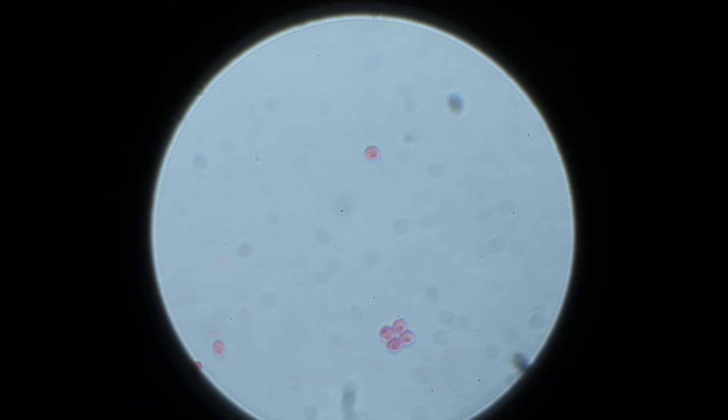And one, two, three, four spots, maybe five in the left one. There's some more yet, and we're starting to see the little sprout coming out of the top.